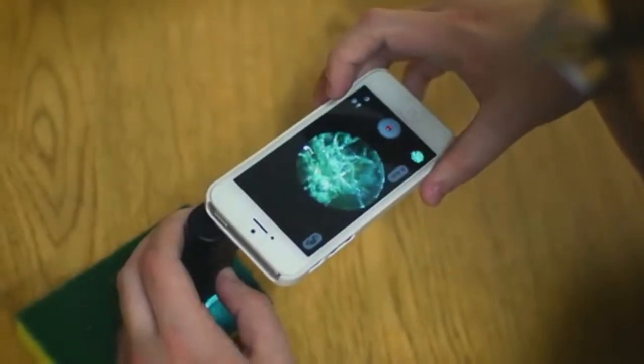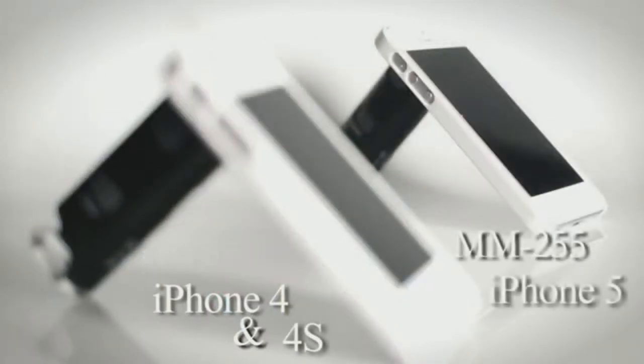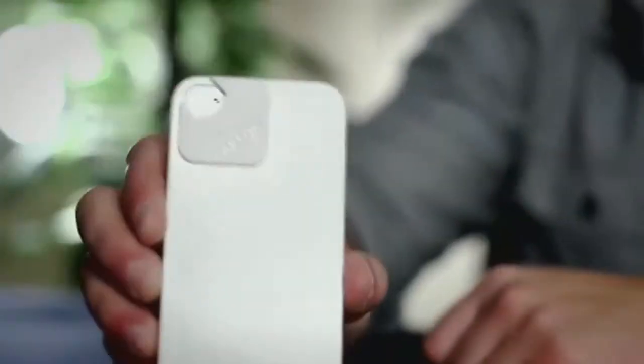You'll be really surprised just how cool this device is. The MM250 fits your iPhone 4 and also the iPhone 4S, while the MM255 fits your iPhone 5. Both models come in a sleek white case.